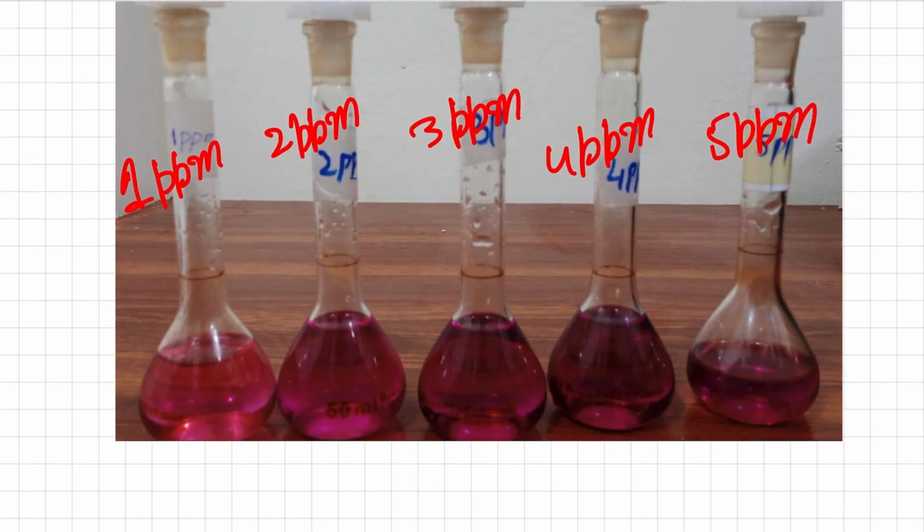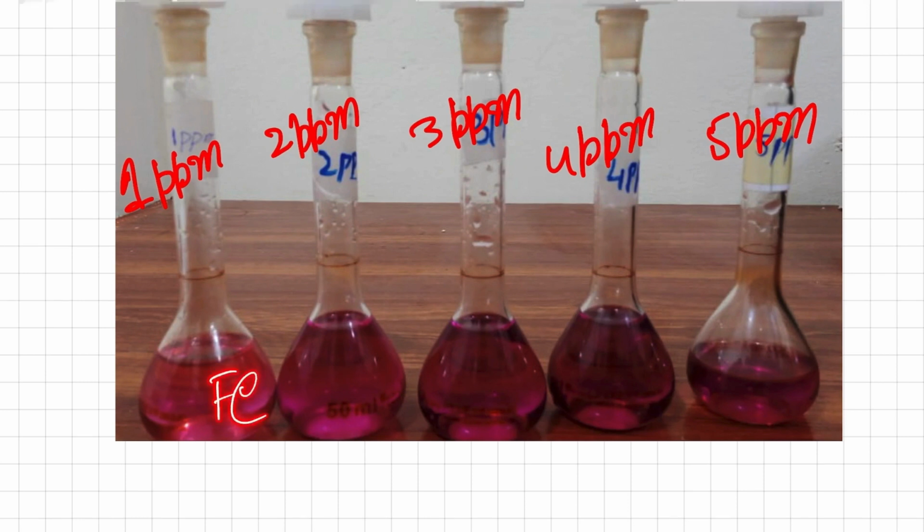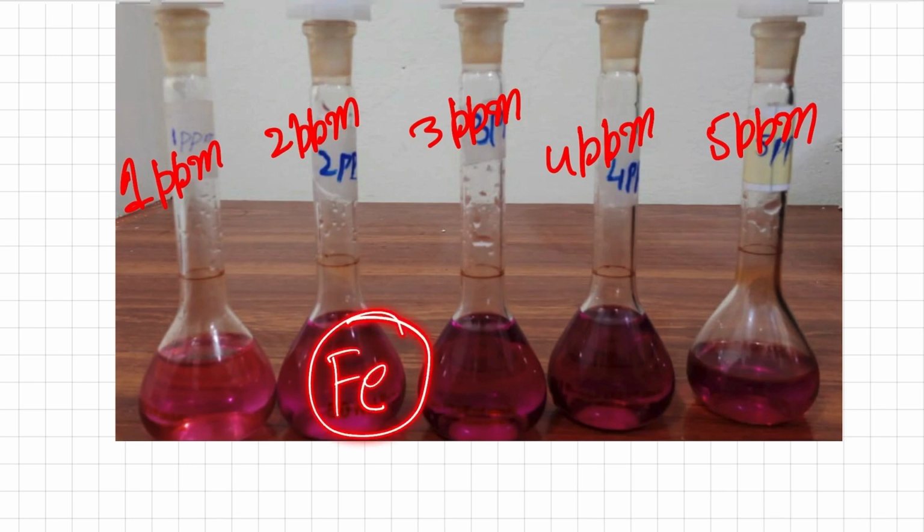And the last question is, what will you do if you are using the visible spectrophotometer and your samples are not colored? So you will do an additional step, which is called the derivatization step. In the derivatization step you will make your solution colored. For example, you are analyzing the iron concentration. So iron solution is usually colorless.